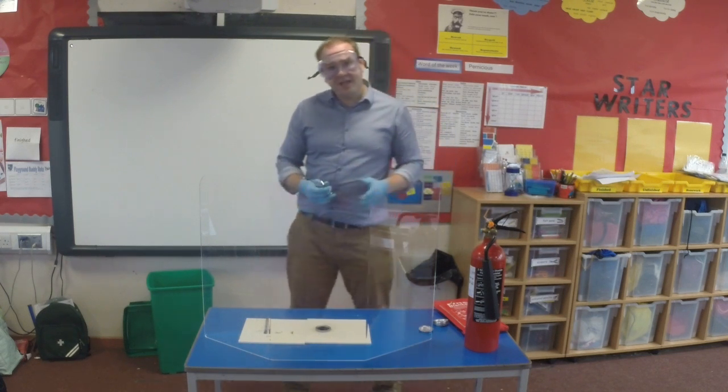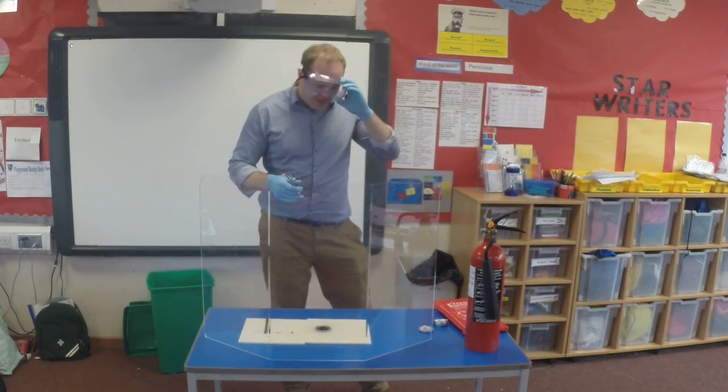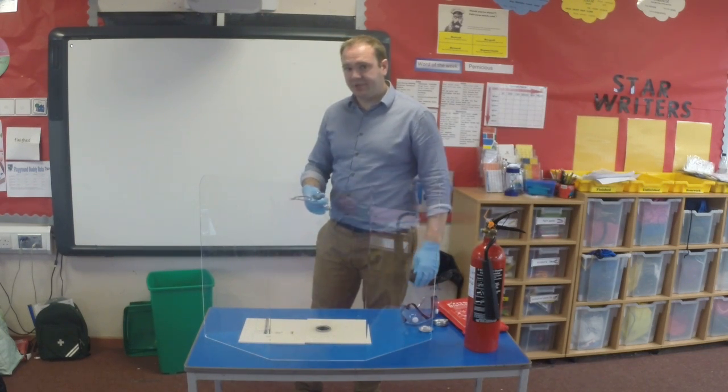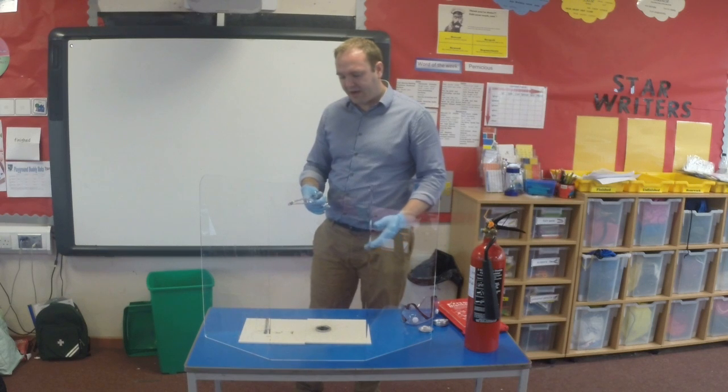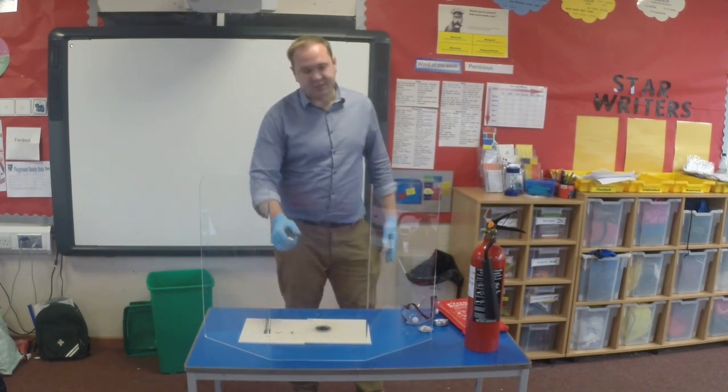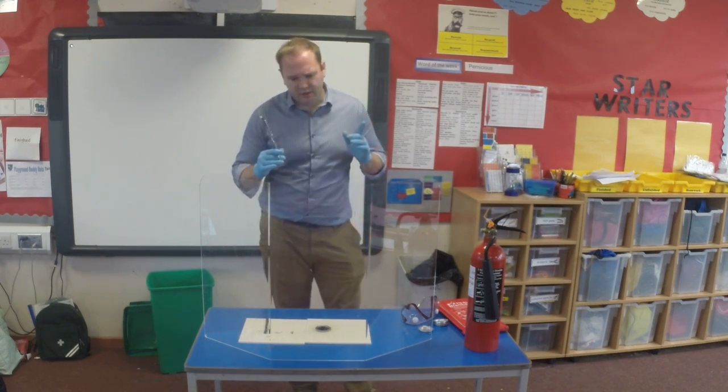When I'm absolutely positive that the reaction has finished, I can dispose of it in a couple of different ways. The best way is to develop a good relationship with your local high school, get in touch with the chemistry teachers up there, get to know the lab technicians, and they will advise you on how to transport this up there.